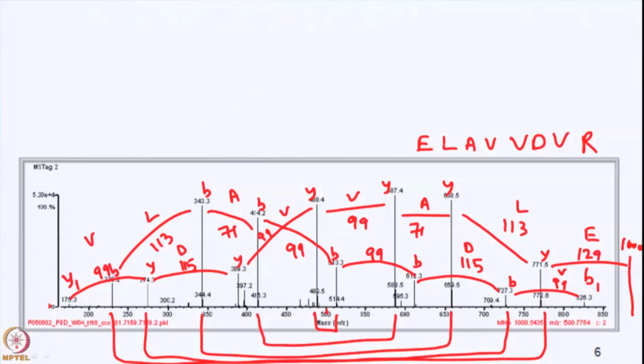No, VD, VD, ALE. Okay, so the E is not right. Should be ND. And why is that? All right. The E, how did I have the, oh, so I can't do, I have bad math, okay? So this is 229. All right, it's not 129.